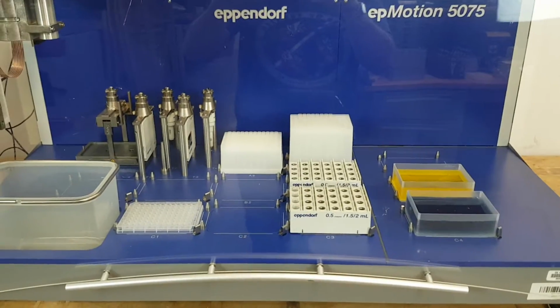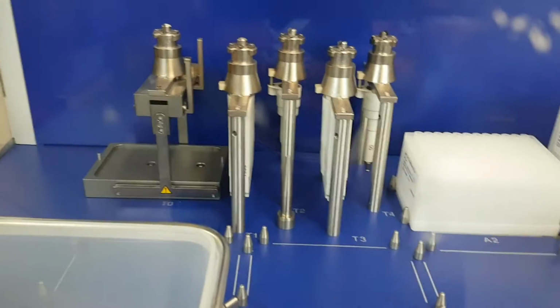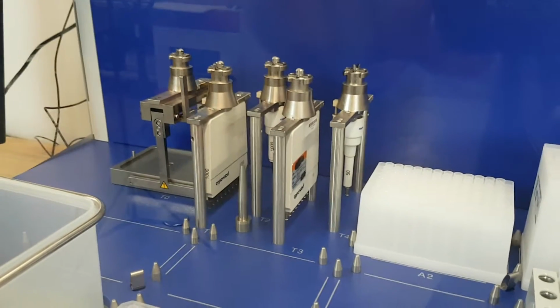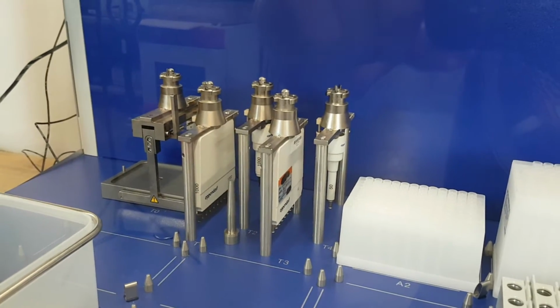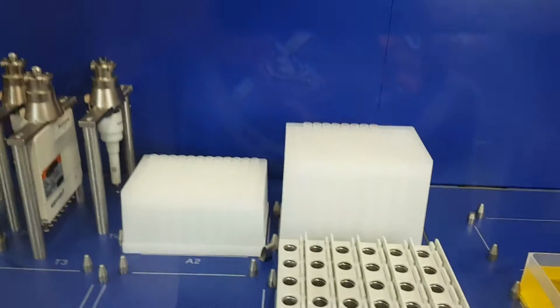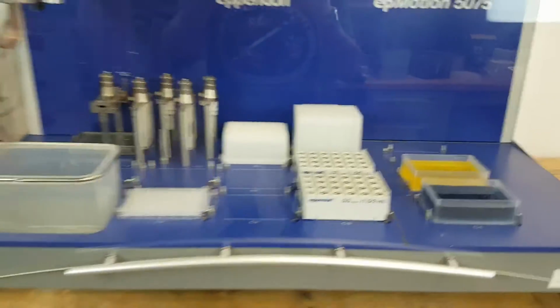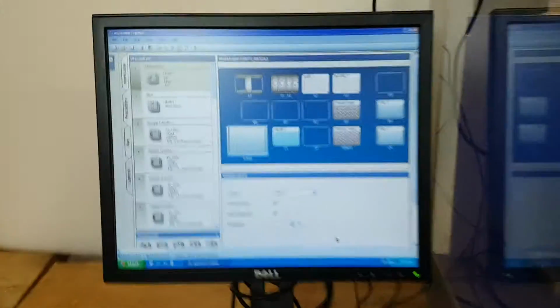deck. We have here a grabber tool and two 8-channel and two single-channel pipette heads. And we got some pipette tips for those heads. So now we're going to go over to the computer here.